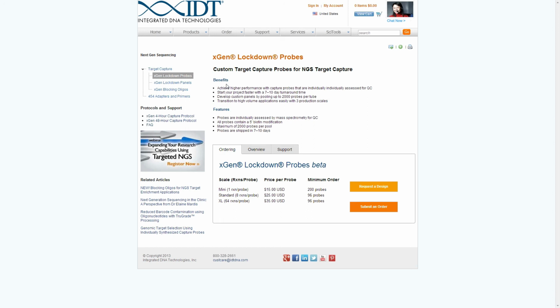But as far as what read lengths we've been using for the Ion Torrent, I believe it's the most common one that most people use. So, to answer the question about read lengths, that is independent of the capture step. That's more about the experimental design.